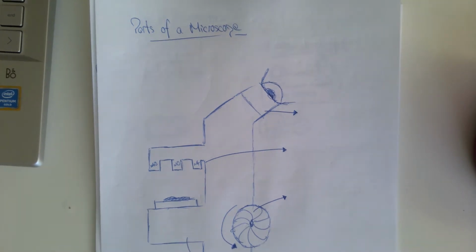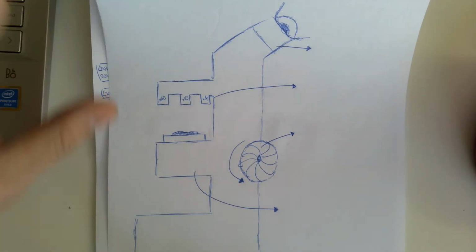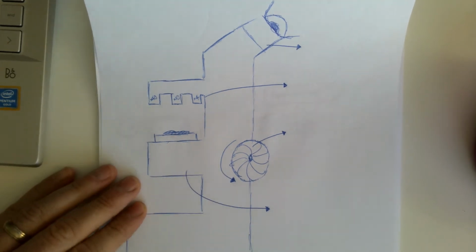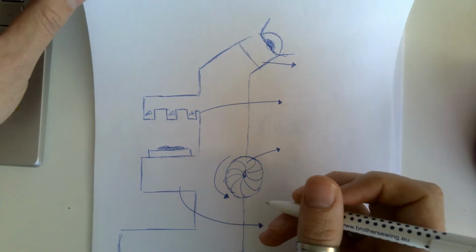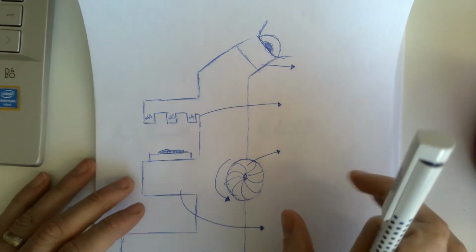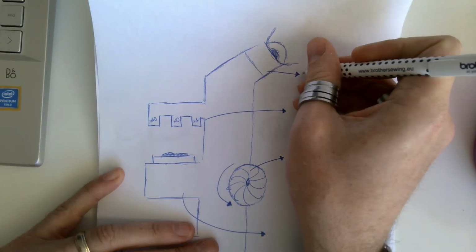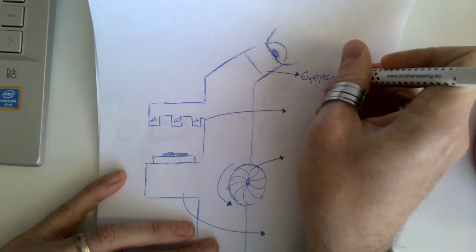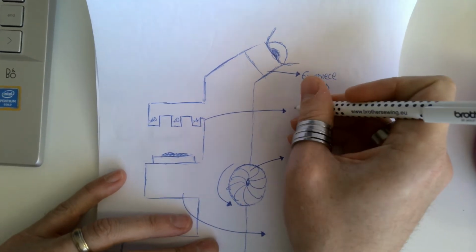So in this one, we're going to look at parts of the microscope and also types of microscope. As you'll see on the screen, we've got quite a basic drawing of a microscope that I'm going to go through and just make sure we understand the names of the different parts and what they do. So, if you remember, when it comes to a microscope, there are two types of lenses. There is the eyepiece lens and the objective lenses.